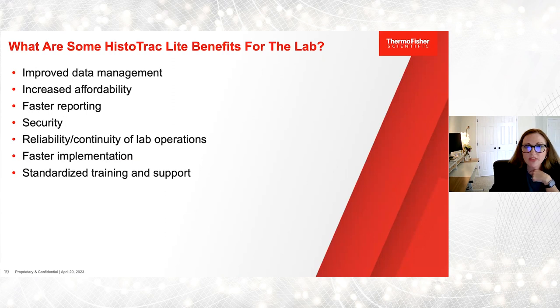And I think with that, we'll go ahead and I'll introduce Dr. Wong. She was gracious enough to share her story on implementation. Dr. Yangpeng Wong is currently the Director of Histocompatibility and Immunogenetics Laboratory at Thomas Jefferson University Hospital and is an Associate Professor of Department of Pathology and Genomic Medicine at Thomas Jefferson University.